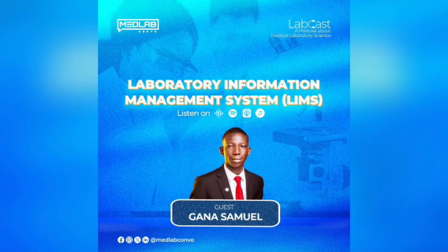All right, thank you so much for that. I would like to ask, how do you think that LIMS practically improves sample tracking and reduces mix-up, especially during periods where the sample volume in the laboratory is a lot? So, when we are looking at LIMS, LIMS has to do with four key areas. There are basically four functions. And the first of all is sample management. Now, no matter how many samples come into the lab, no matter the workflow that comes into the lab, each of these samples is given a unique number.